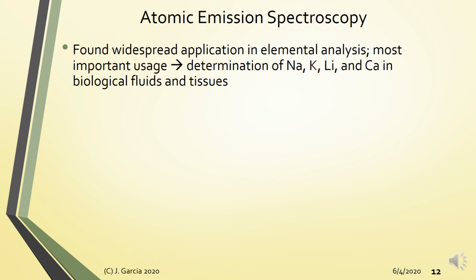If you work during your OJT with the IRRI, International Rice Research Institute, or any related institutions, usually they still have your flame emission spectrometers, which are designed to specifically measure sodium and potassium levels accurately.